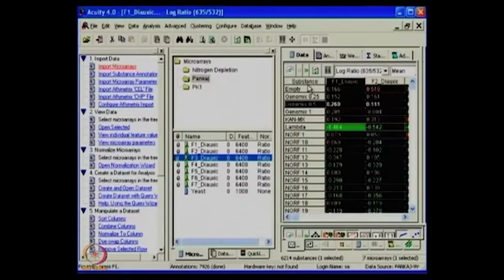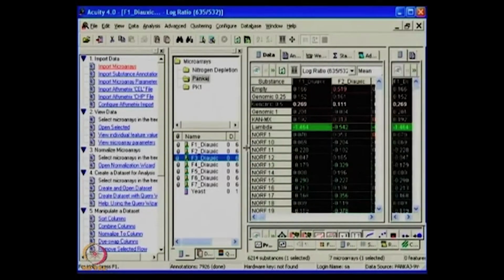So once you have all the data normalized after the import, and you have the annotation and the parameter file ready for you, there are a few ways with which you can look at the data. I think before moving forward, it's important to ensure that normalization was done properly, and one needs to look at each slide carefully. Yes. As we discussed earlier, it's very essential to have the same normalization process done for all. And it is not a thumb rule which one is more preferable. One can choose anything, but make sure all your different slides are handled in a similar way.